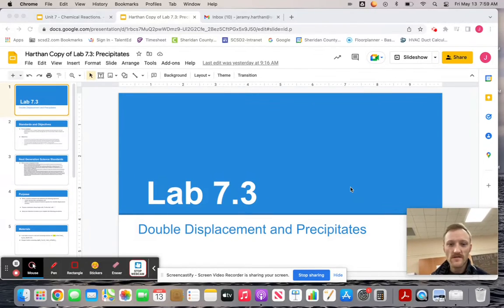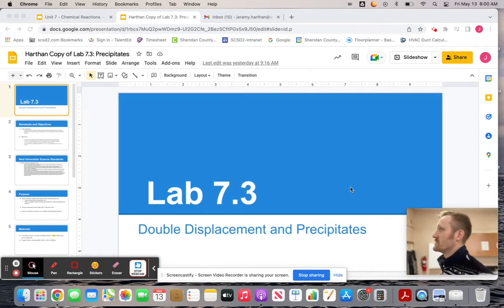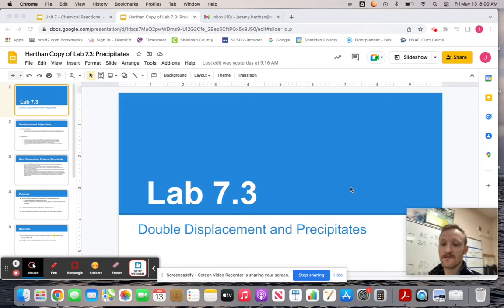All right, good morning. So this video is to talk about and get data for our 7.3 double displacement and precipitates lab. If you're absent for this lab, basically what we're going to do is have six double displacement reactions that form precipitates. What we really want to make sure we understand is that we talked about our two types of displacement or replacement reactions.